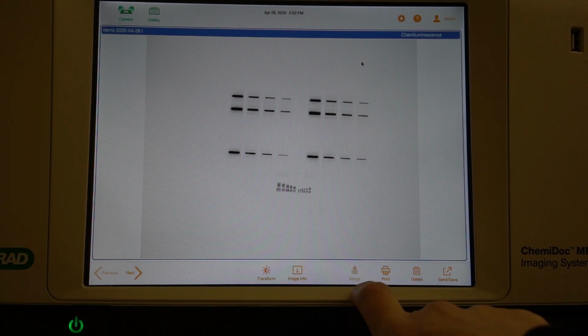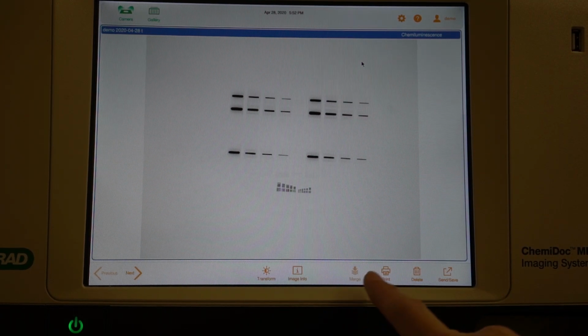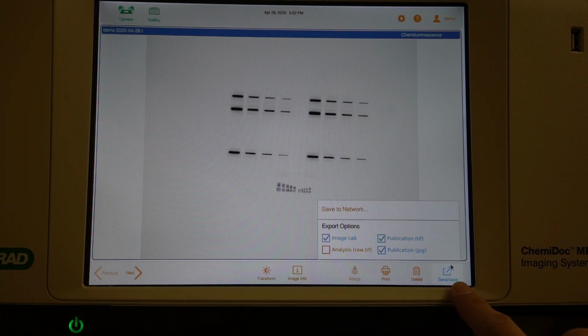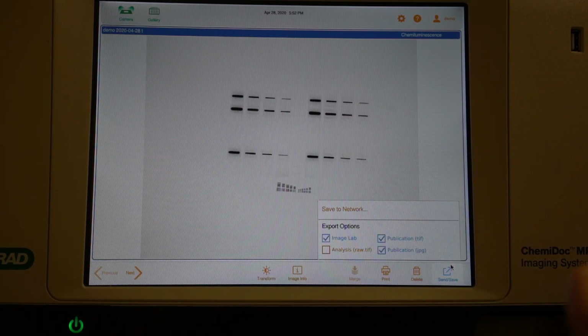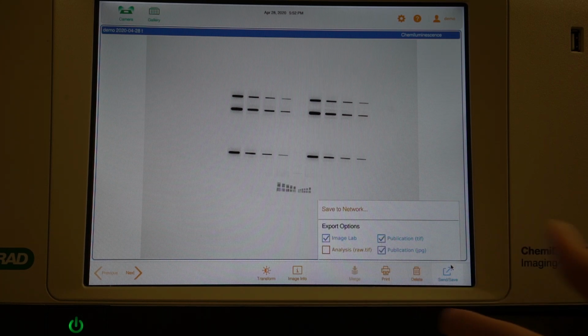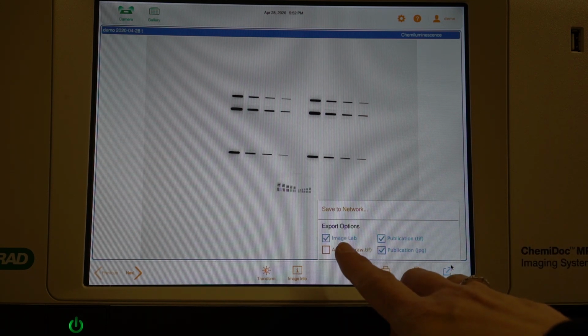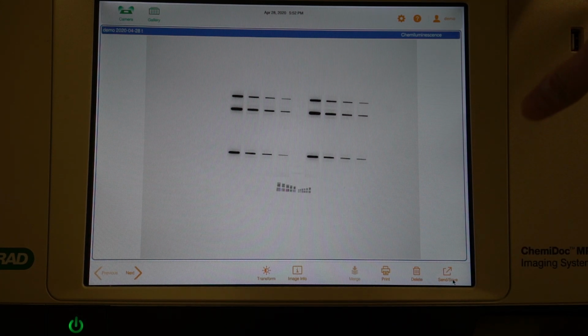Down here, you have some other options. If you're in your gallery, you can merge some images together. You also have the ability, here is the send save button. So if you do have an external hard drive plugged in, that'll populate here and you can save to that drive. You can also export as a publication TIFF, publication JPEG. You also always want to export as ImageLab file, because that way this file type will be able to be pulled into our ImageLab software for further analysis.